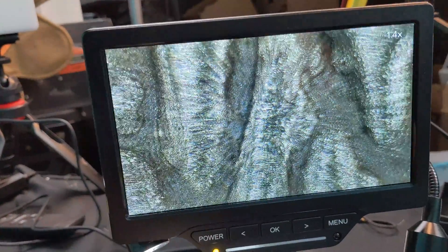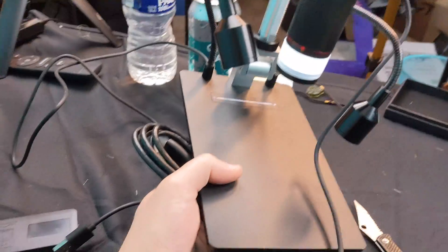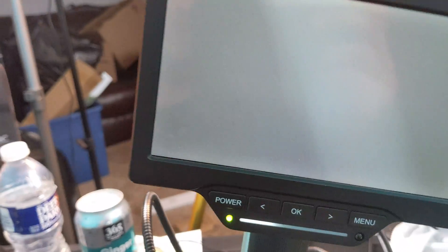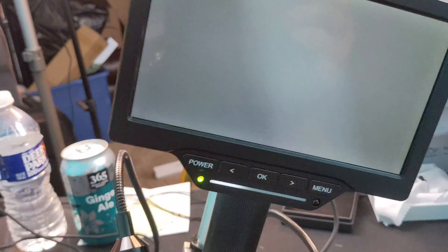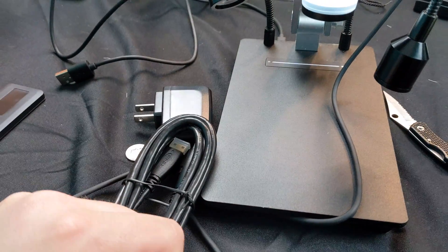Incredible, guys — absolutely incredible for whatever you're using it with. The greatest thing of all: this is portable, so it doesn't have to be plugged in. It is fully portable — you just plug it in to charge it. As you can see, we can do everything and no cable is plugged in at all.